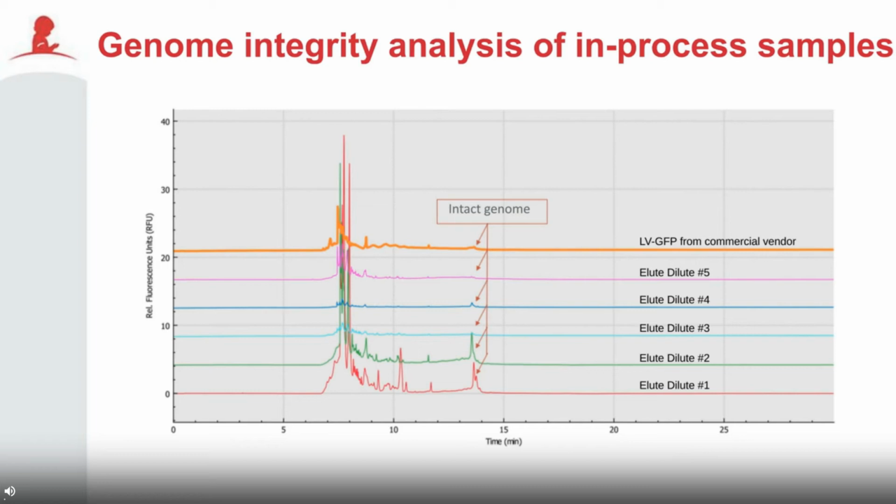So back to the samples that were obtained from St. Jude from our GMP. So this shows results obtained for these. Samples were injected with a pressure injection and separated at a capillary temperature of 30 degrees Celsius. So with these samples, the number of transducing units would not normalize.